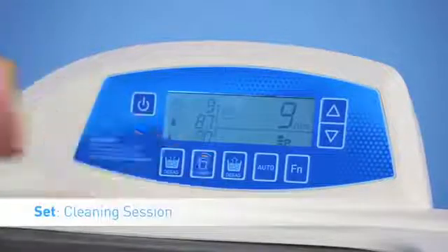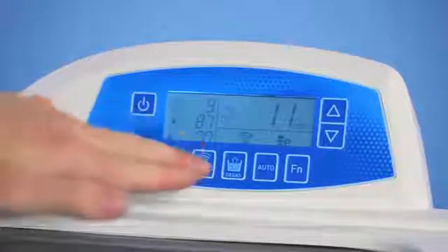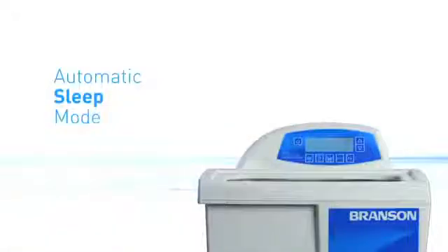The Bransonic Digital CPX-H ultrasonic bath is the only bath that is fully programmable. The digital display allows users to program and lock in the cleaning settings for their session. It not only helps reduce operation errors, but it also allows for autonomous operation after the bath is programmed and the cycle is started. Once the runtime is complete, the digital bath will shut off automatically, delivering the same results every time.